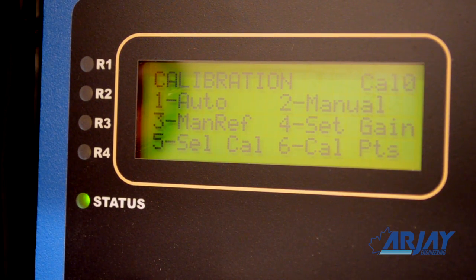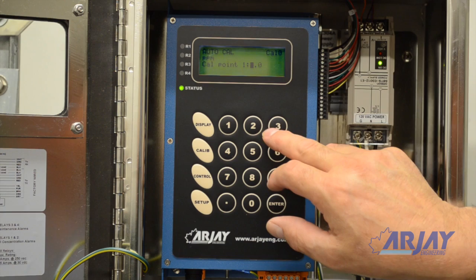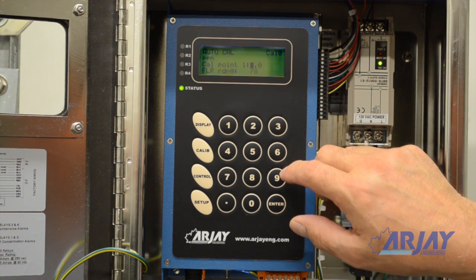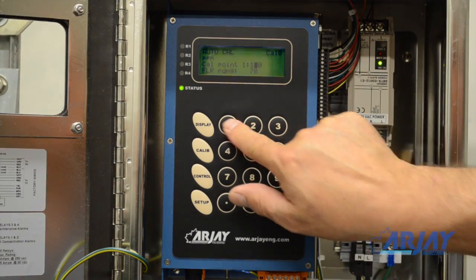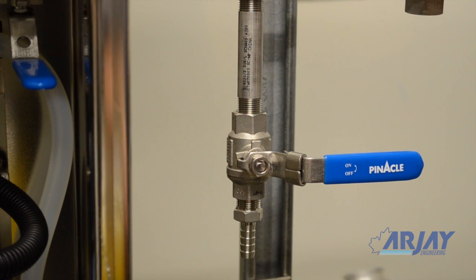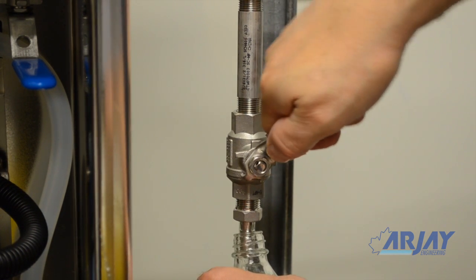Follow the prompts and enter the PPM value of the sample as it passes through the instrument. Since this value may not be known at the time of entry, you can substitute a temporary value of what will be typical. This will be corrected later. While this value is entered, take a grab sample of the water to be sent to your lab. This completes the first calibration entry.